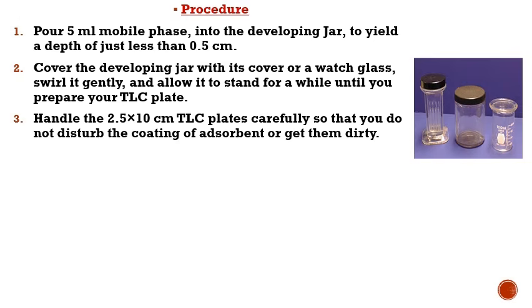Then, carefully handle the TLC plate so that you do not disturb the coating of adsorbent or get it dirty. Your hands should be very clean, and any disturbance to the coating of the adsorbent will ruin the whole experiment. So please, as the TLC plates are very delicate, you should be super cautious while handling it.